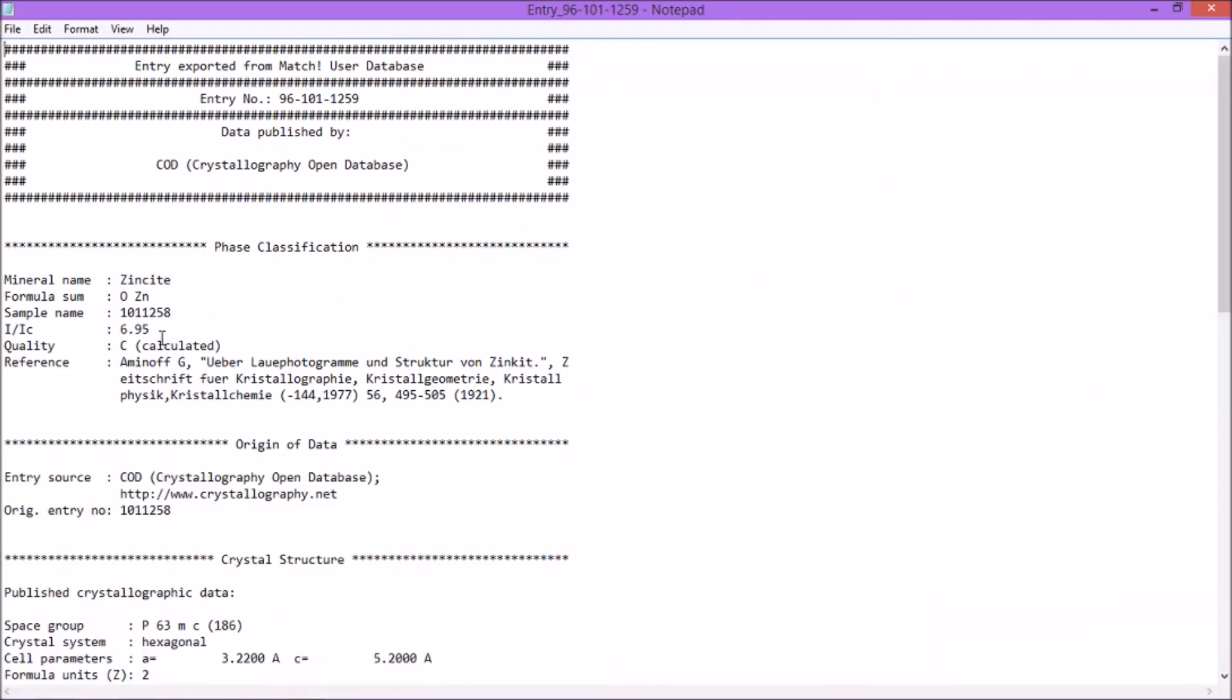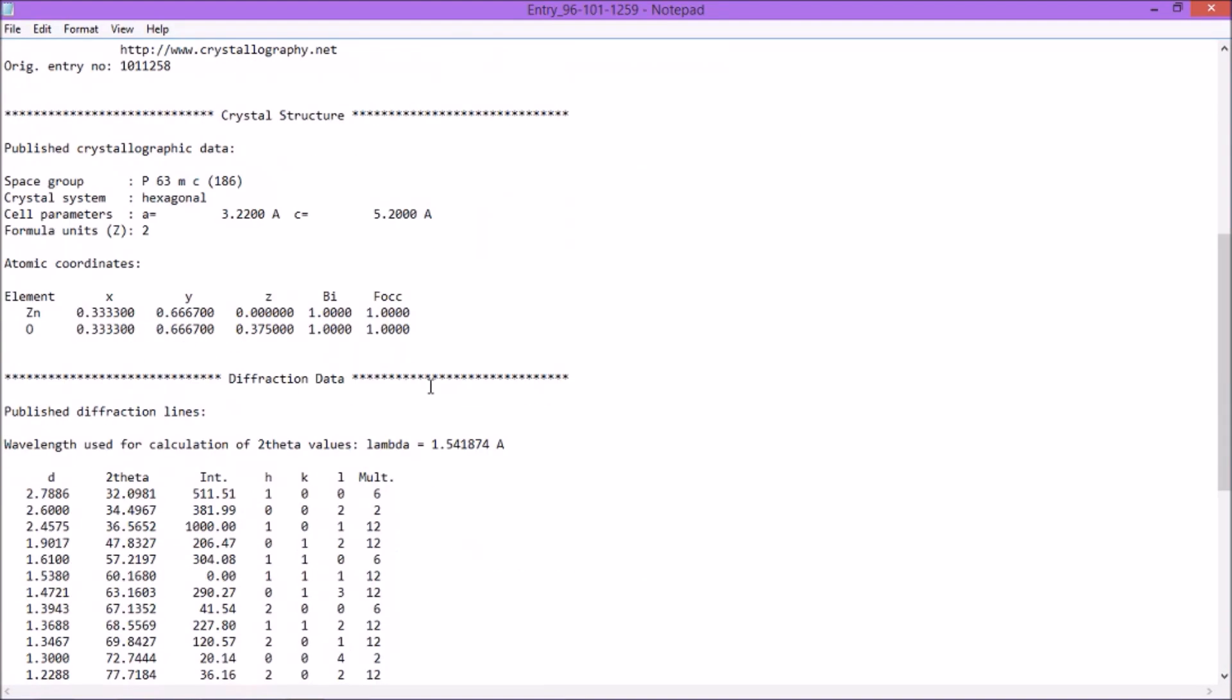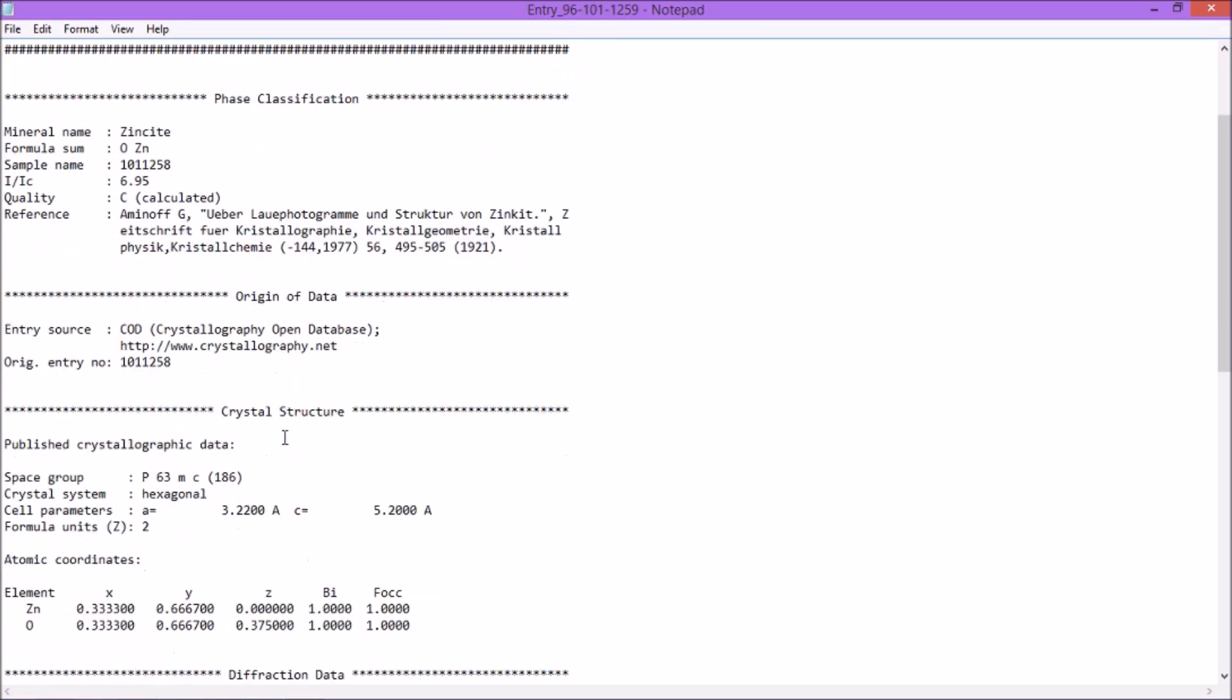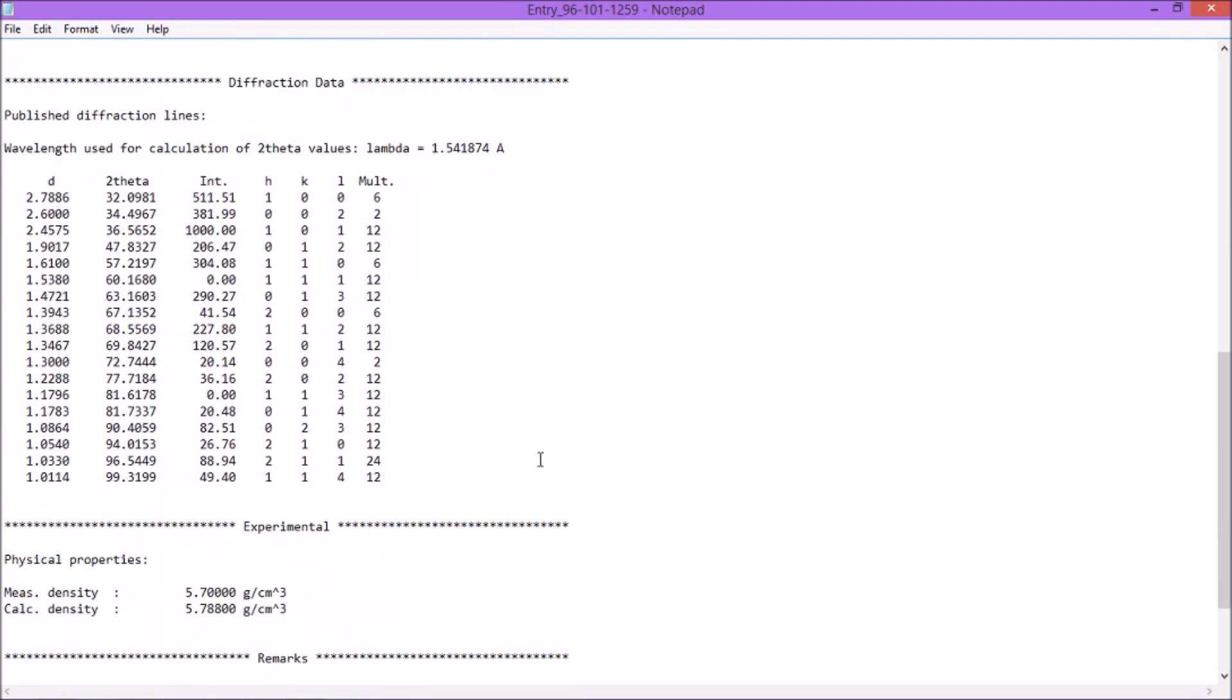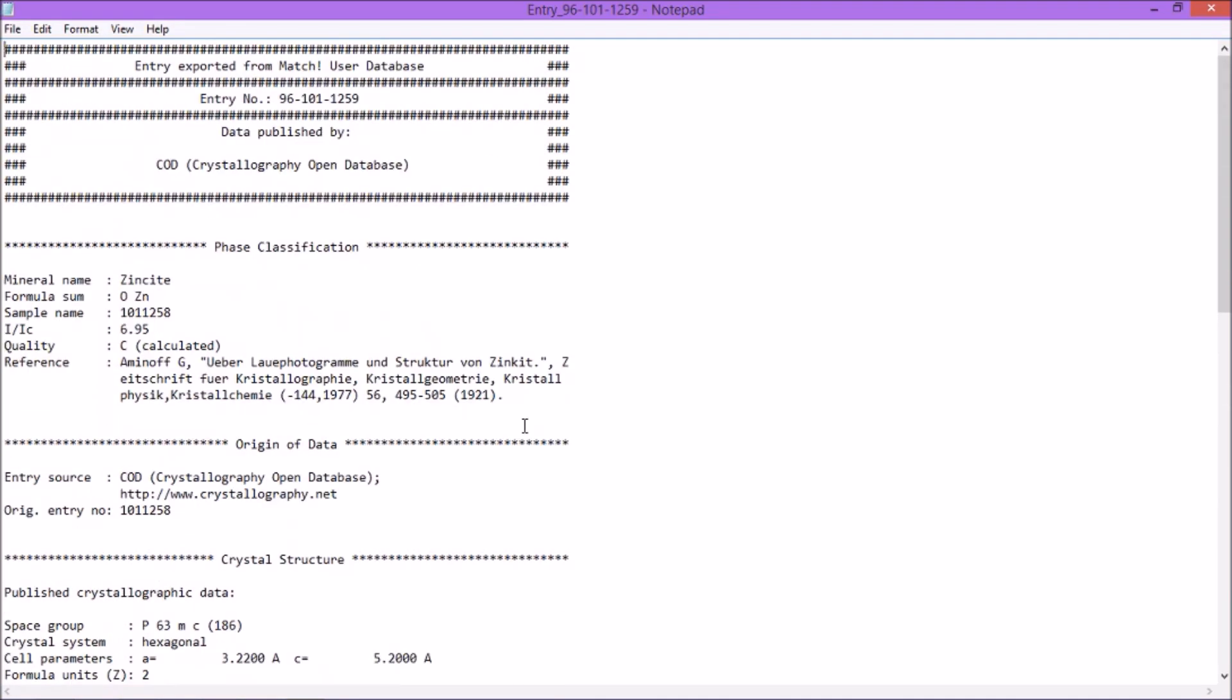You can see the reference here. The EDS values are all there as well. And you can see the d-spacing in angstrom, the two theta values in degree, and the corresponding hkl values. You can see it.